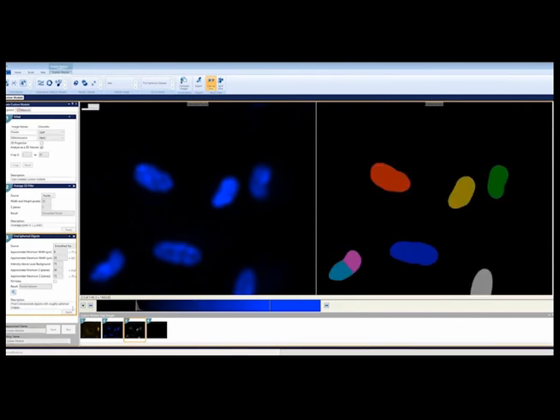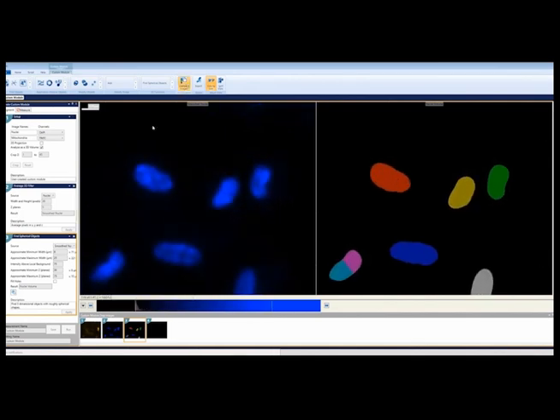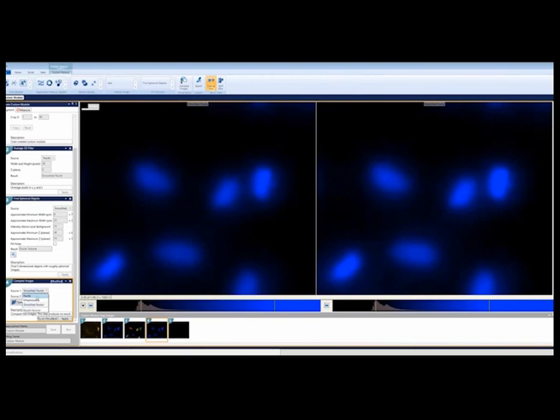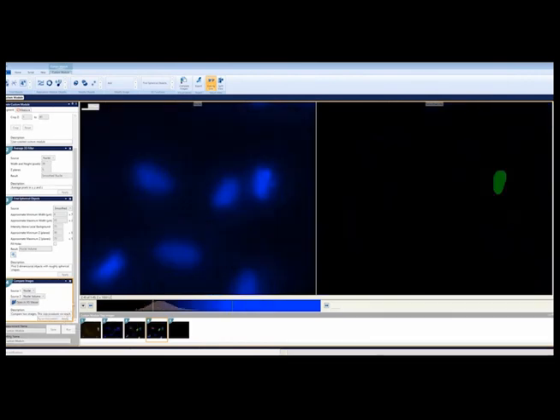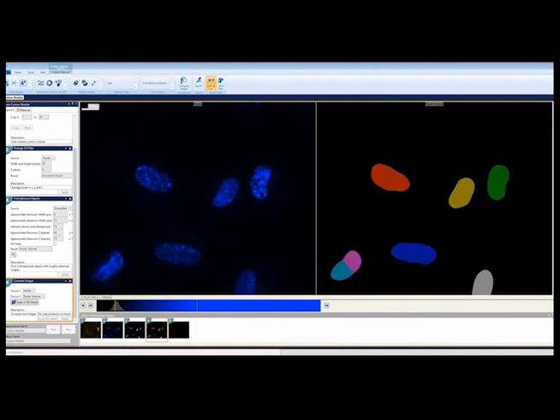The result of the segmentation is a cell map. A cell map is a colorful mask where each individual nuclei is represented by a color. As you navigate through Z, the objects remain the same color. Now we process the source image, then segment into processed image. This is a good point to review our source and our segmentation to make sure the segmentation looks correct. To do that, use the Compare Images step card and choose the original source image and the result of the segmentation. You can also open the images up in the 3D viewer to make sure the shapes look correct as a volume.